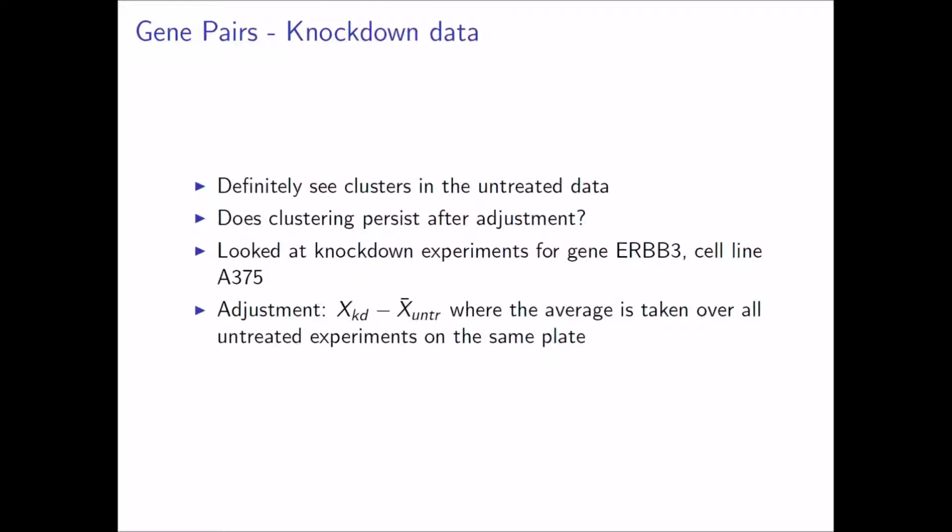So one thing I looked at, and I know that this has been done, is subtracting off the controls on a plate from the other experiments, the perturbation experiments, and dealing with the difference values. I know Shannon did a lot of that with his cosine distance work, and it seems to be at least somewhat the common method for dealing with some of this. And so, is there a question?